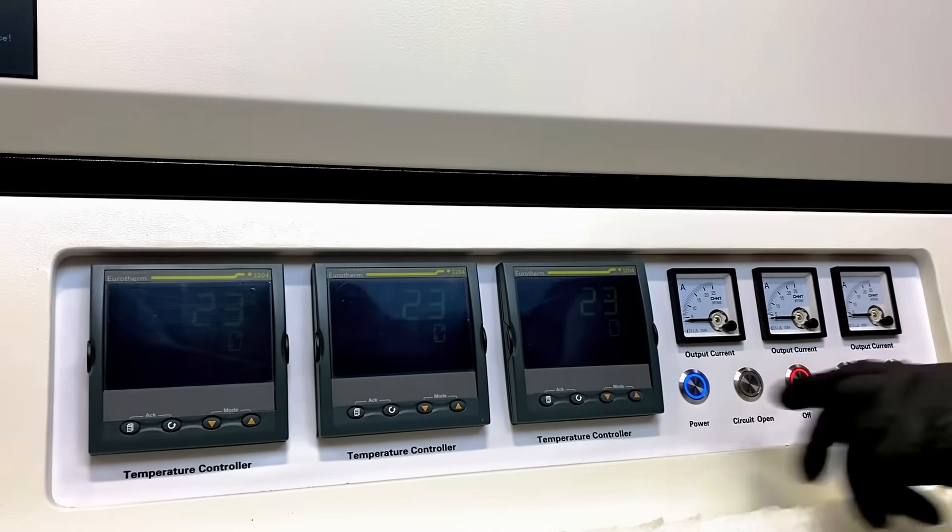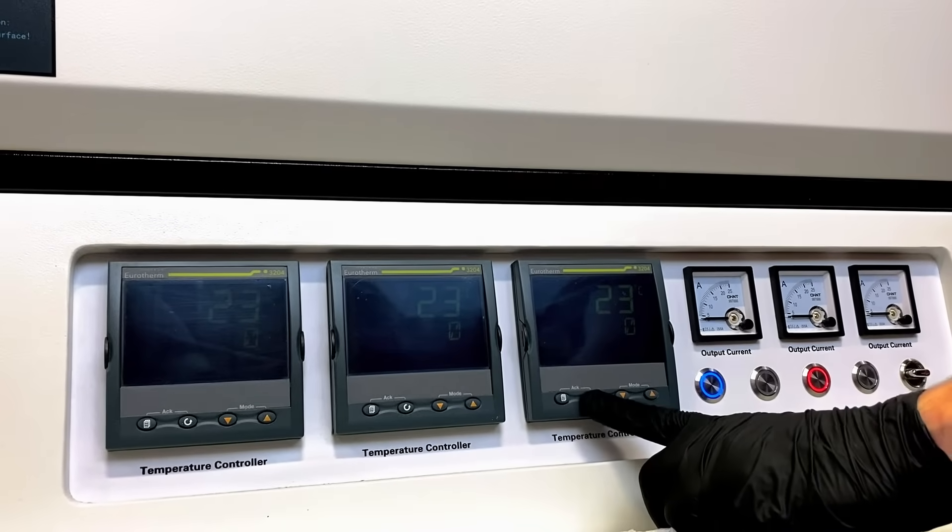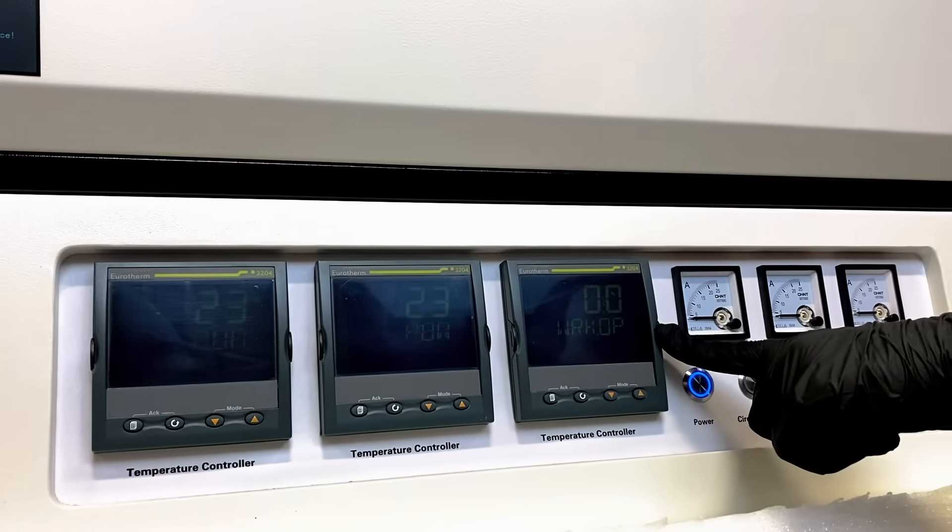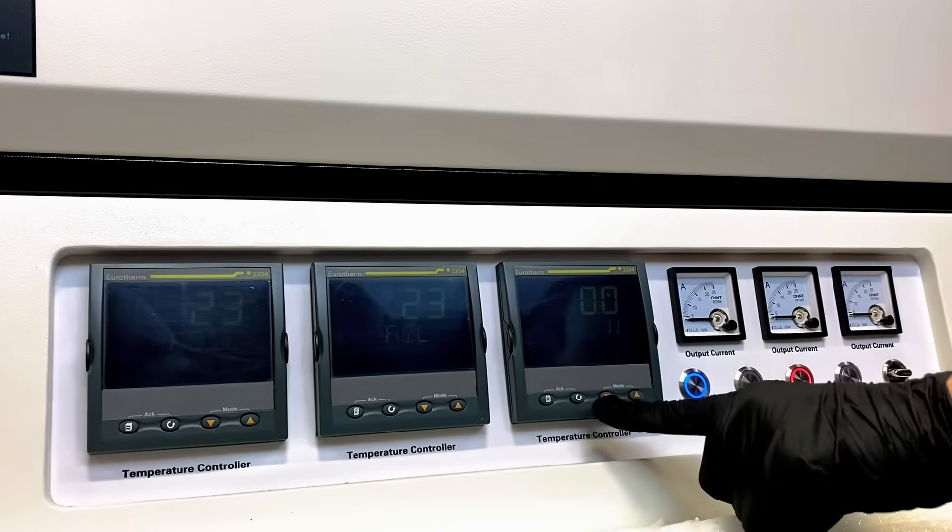Then, in order to set our program, we will press the cycle button. This is the working operating parameter that's set by the program, so we will leave this alone and press cycle again.